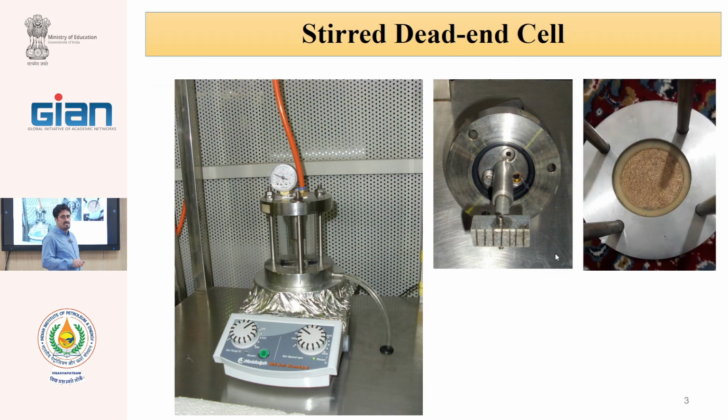This is a sinter filter. Sinter has a very big pore size and is usually used as a gas filter. In some valves, at the entrance of the valves, this sinter filter is used. Here it is only a support for keeping the membrane. We put the membrane here.